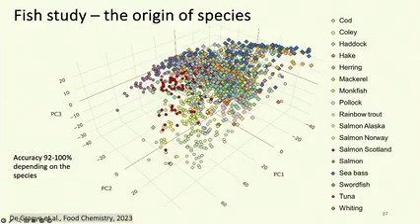Another food application is the huge study of fish species. The fish meat was collected from different parts of the world, I think. Yeah, I'm pretty sure. And there are a lot of fish species to detect and distinguish from. We do have this huge model, and depending on the fish species, our accuracy in classification goes from 92 to 100%. So I think it's very great performance.